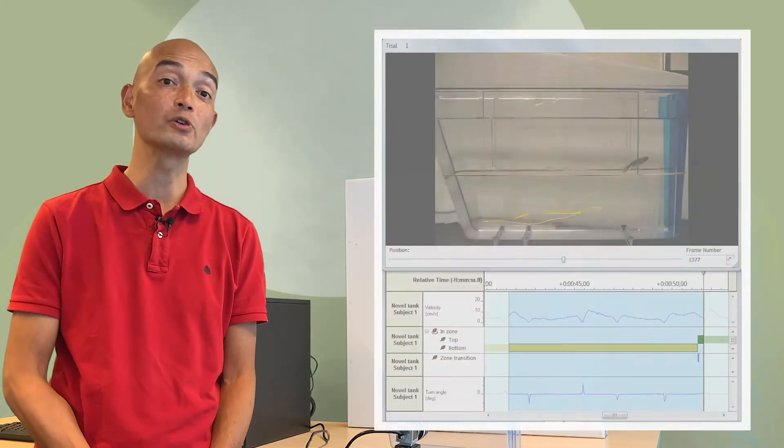So why use video tracking for this? Well, scoring these behaviours manually is a challenge because zebrafish move quickly.